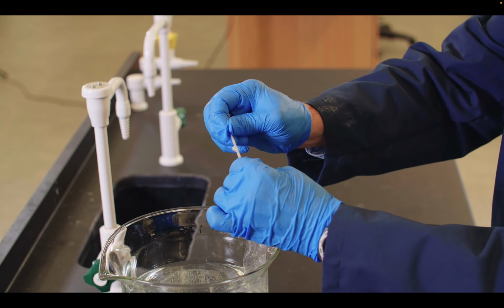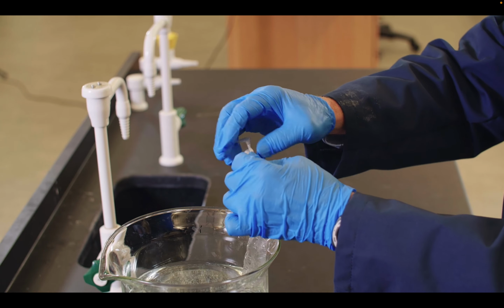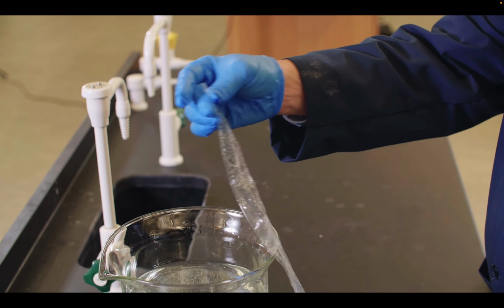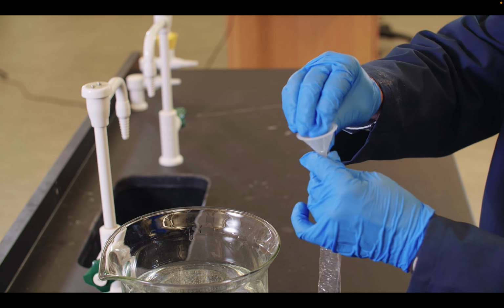And so tie a knot towards the end, make it nice and tight. That allows things not to seep out the end. It's always good to tie a double knot. Sometimes people like clips, but clips seem to leak more frequently, so I think knots are better. So we have one end knotted up, and then we want to put our solution in here. And so I'm just going to use a little funnel, and I like to have that to help pour it in so we don't spill any.